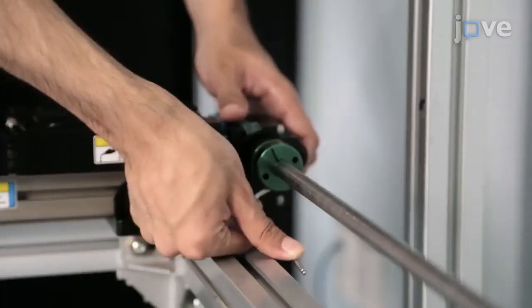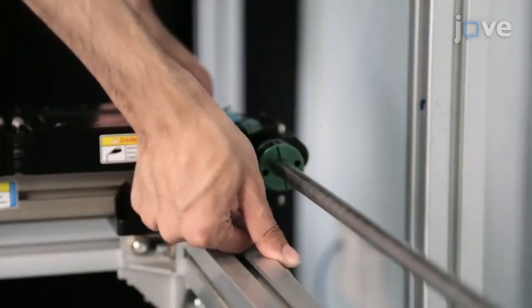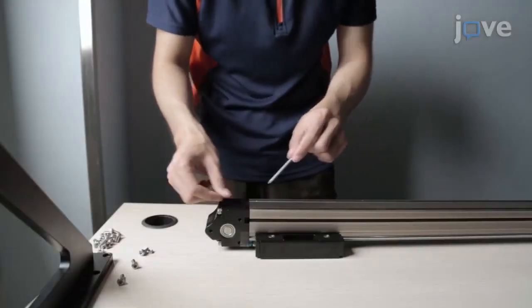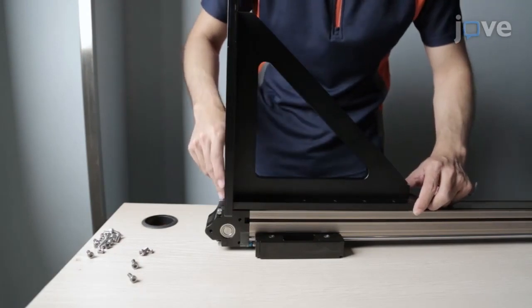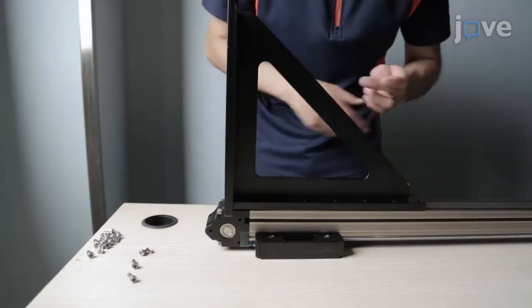Tighten the lock screws of the couplings to synchronize the shafts of the two rails. Put six nuts into the back grooves of the Z-rail and attach one side of the right triangle frame to the back of the Z-rail with screws.